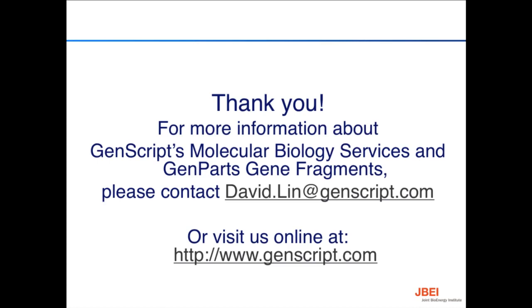Okay, that makes sense. And then Isaac has a question, just about your general thoughts. Do you have any thoughts about E. coli in vivo assembly? Yeah, so there are methods like SLICE. You would almost call that an ex vivo type of approach, where you basically have E. coli that's overexpressing maybe the lambda red types of recombinases or other types of recombinases.